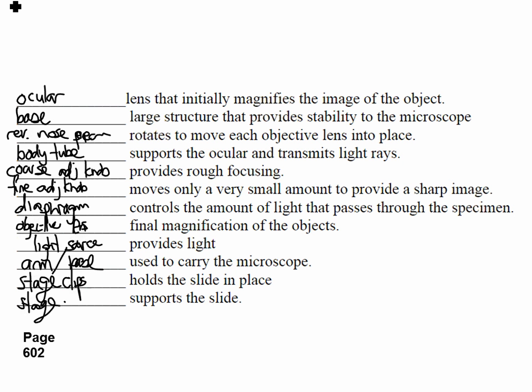All right. So let's now talk about the way the microscope magnifies things. You've probably all held a magnifying glass. Now, these devices are made of lenses. And lenses are essentially transparent material, like glass or plastic, with at least one curved surface.